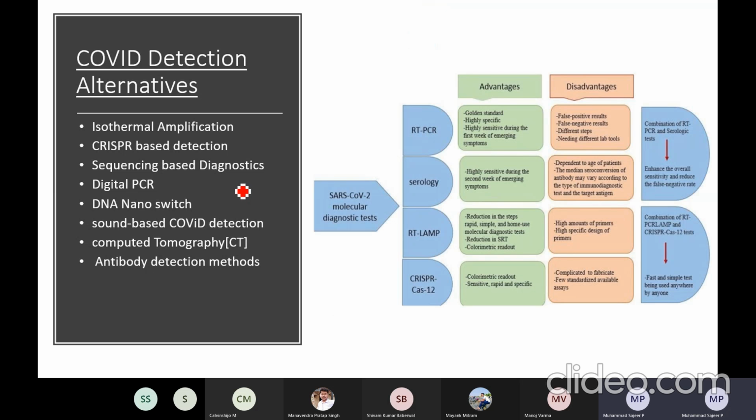So for COVID detection, there are a lot of alternatives to our PCR method. CRISPR-based detection and isothermal amplification were already well explained by Mayank, and that was great. The isothermal amplification technique does not need thermocycling. As you mentioned, we have LAMP and RPA, loop-mediated isothermal amplification and recombinase polymerase amplification. A strand-displacing DNA polymerase initiates the synthesis, and the other primers form a loop structure to facilitate subsequent amplification. So that is an interesting thing.